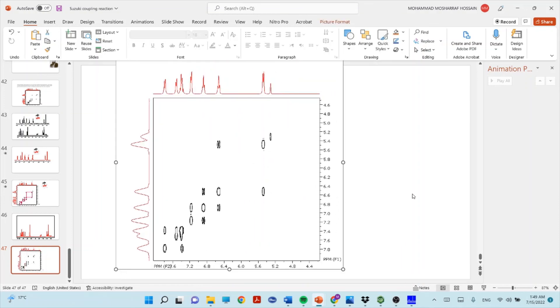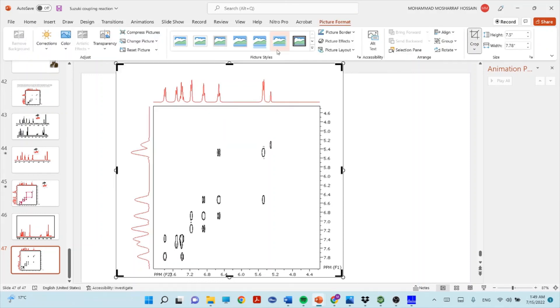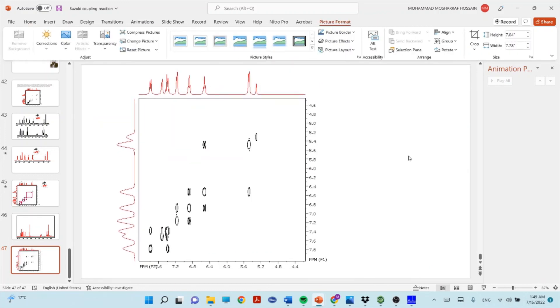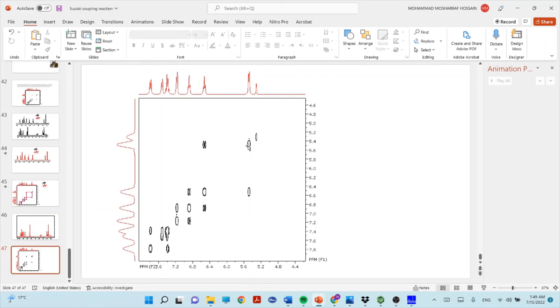Paste the spectrum into your Word or PowerPoint file. You can resize it by cropping. You'll see a nice 2D COSY NMR spectrum. The peaks along the diagonal are called diagonal peaks — those represent the real peaks of the compound. The cross peaks, which appear away from the diagonal, always appear as mirror images of each other. Those correlated cross peaks indicate that the two corresponding protons are adjacent to each other.